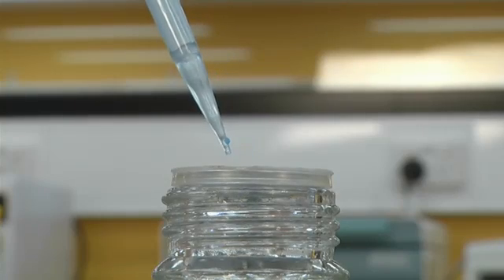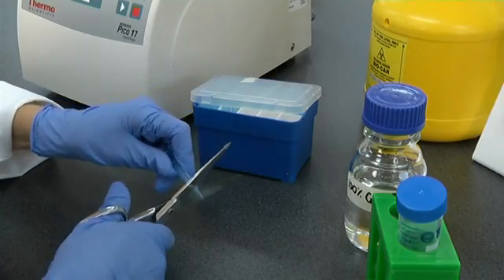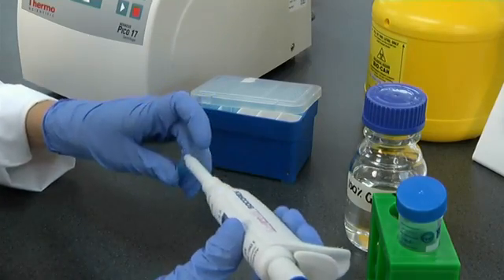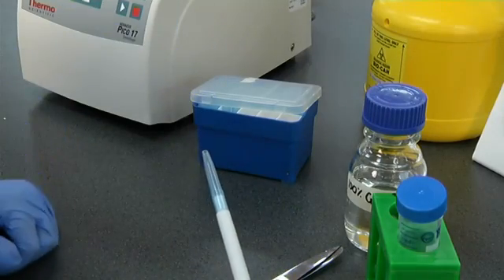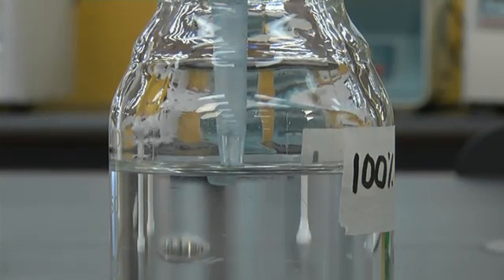Fortunately there are a couple of techniques you can use to avoid these problems. It is possible to widen the opening of the tip by using scissors to cut off its end. This makes it easier to draw up the viscous liquid.